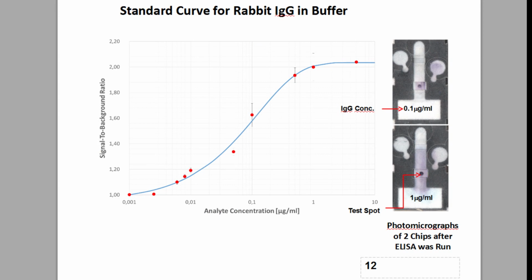Using this device and the protocol described above, we have obtained a dose response or standard curve for our system. The curve is shown at the left. The limit of detection was about 4.7 nanograms per milliliter, which is quite respectable.